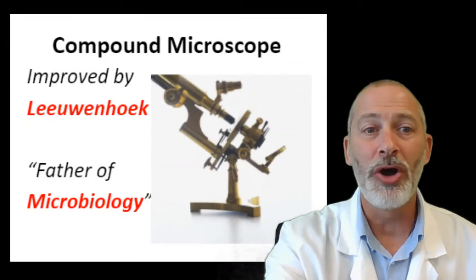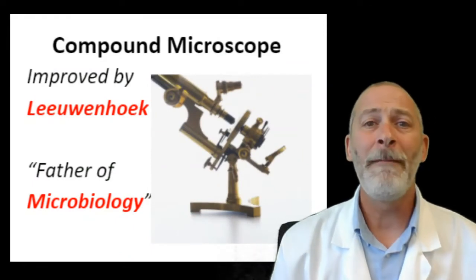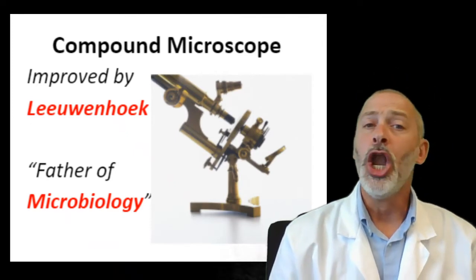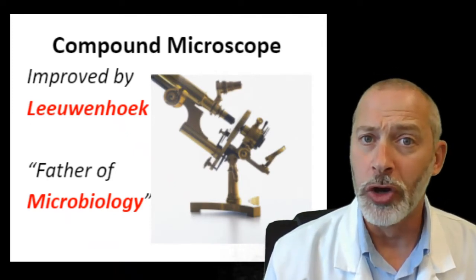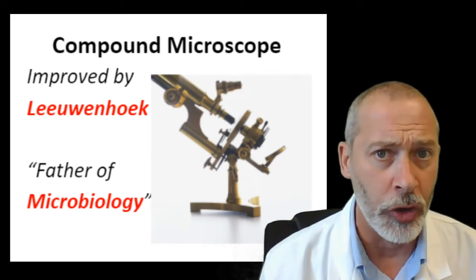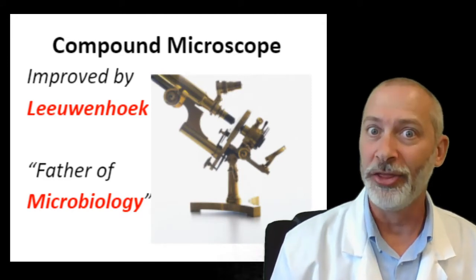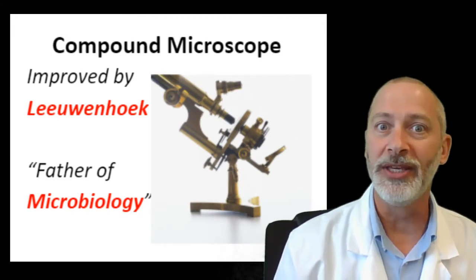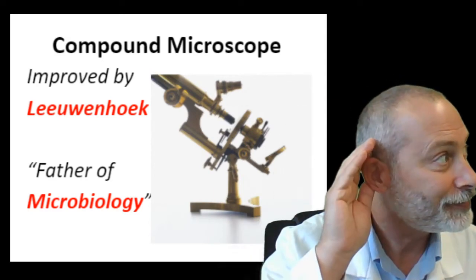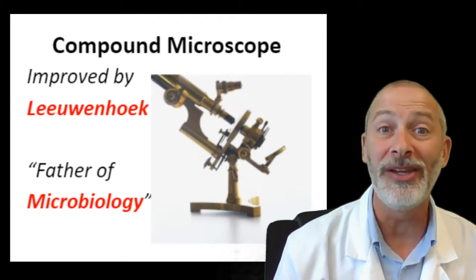Yesterday, you may recall, we finished up with talking about the compound microscope and mentioned the name Leeuwenhoek. Now, why should that name Leeuwenhoek sound familiar to us this week? Who is Leeuwenhoek? That's right, the scientist of the week this week.